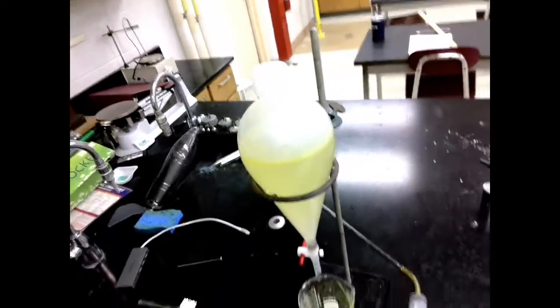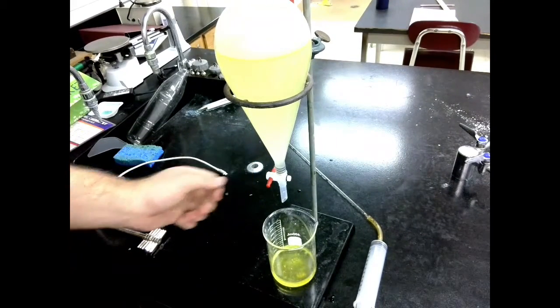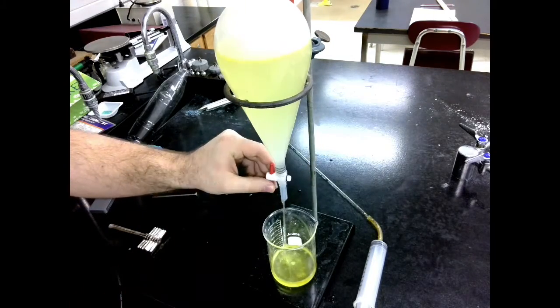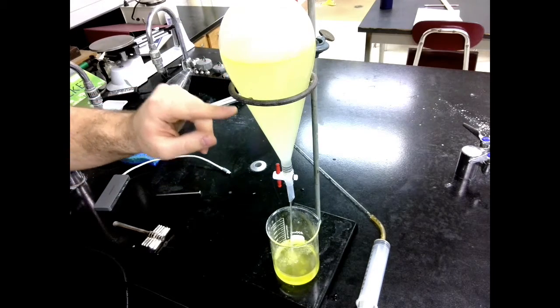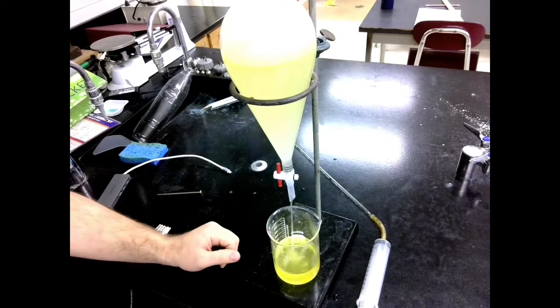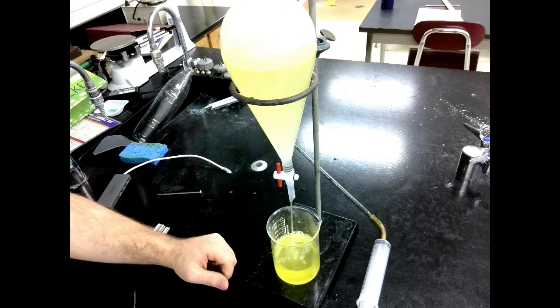So, once I'm ready to go, I've got my oil all ready to separate. All I'm going to do is turn this stopcock here and allow the fluid to start draining. So you can see it drains out nice and steady. And I'm letting all of this water drain. And it doesn't matter what I do with it, because this has all of that excess organic material that isn't a part of the oil. What we're looking for is the fragrance. So this can all just go down the drain.